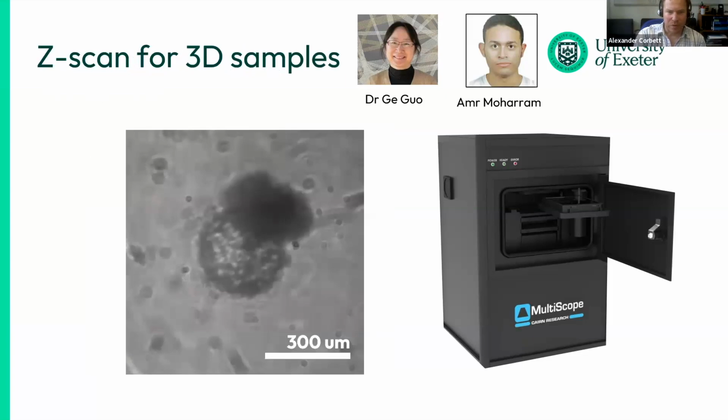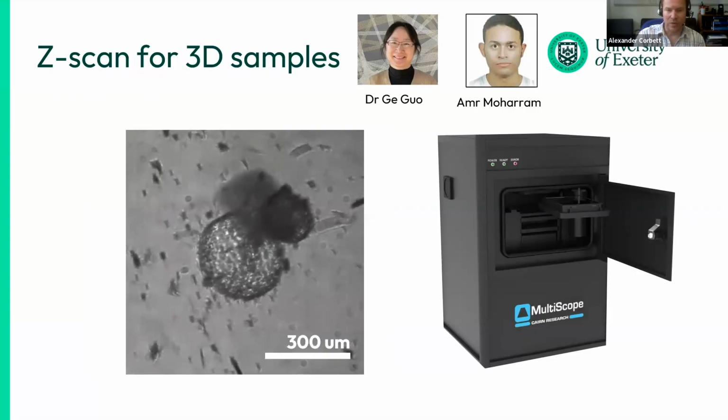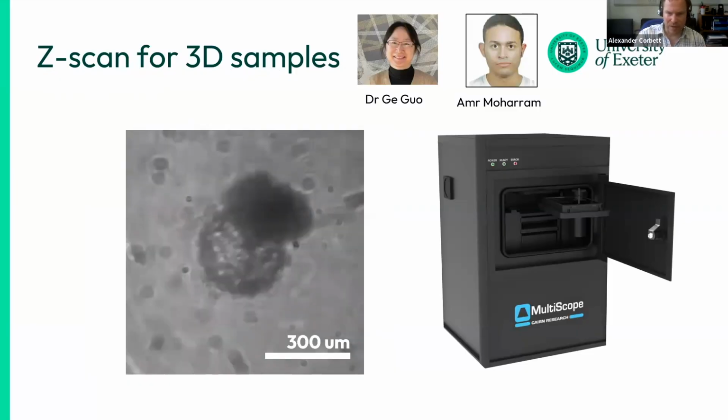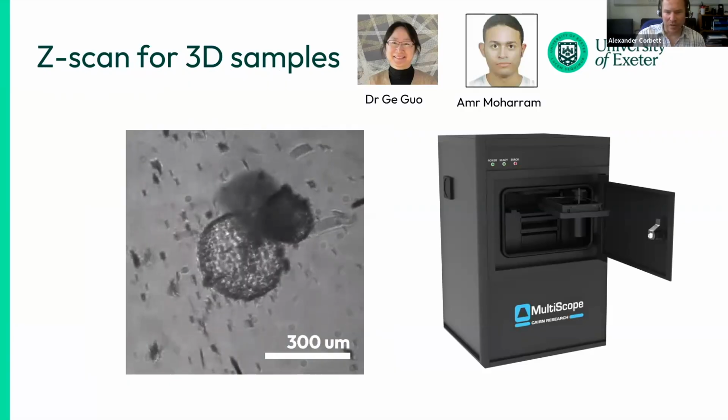As I showed before, we can also get a Z stack, and this is important in this case because sometimes you get strange situations like this, where instead of just one organoid, we can have 2, or in fact 3 slightly different sizes sitting on top of each other, and that means we can get a rough depth coding of each pixel in the image to help interpretation.